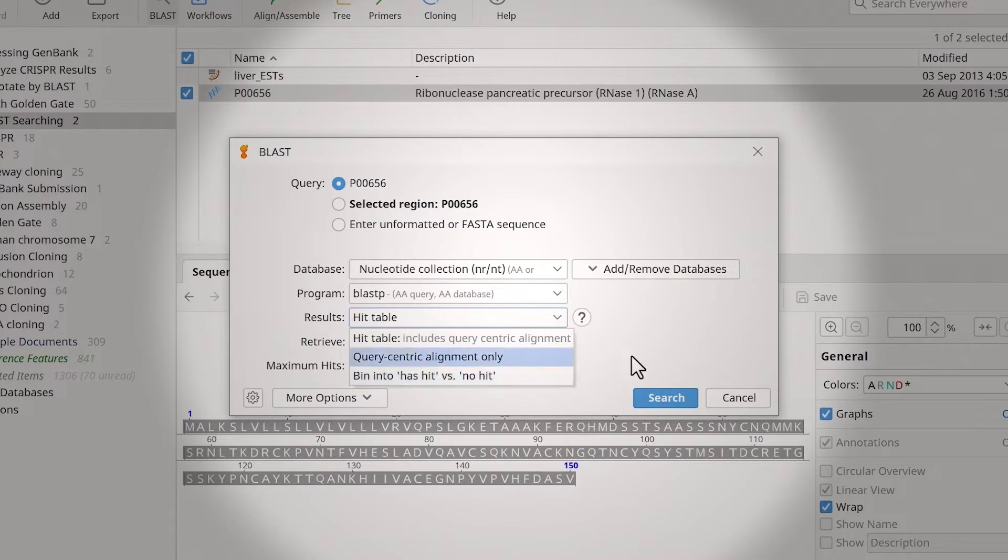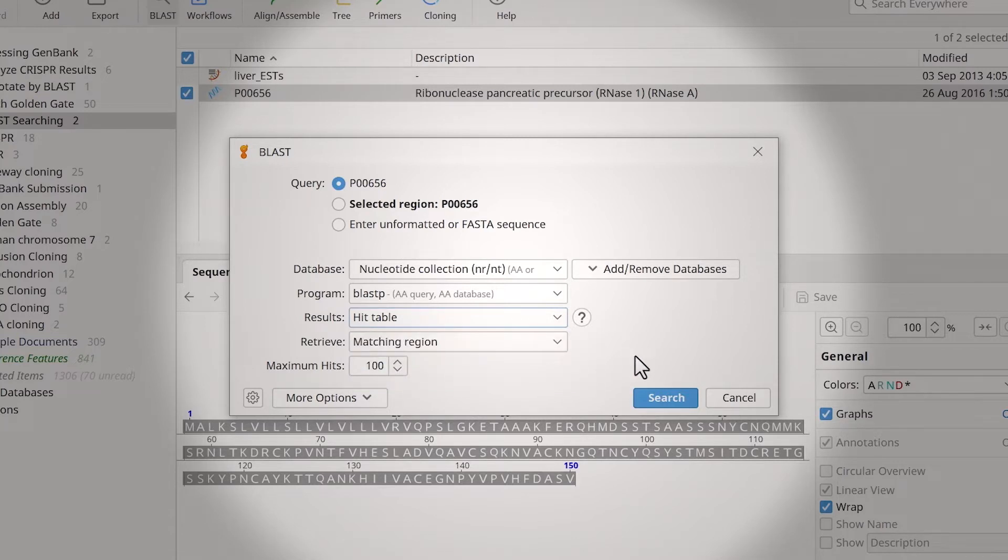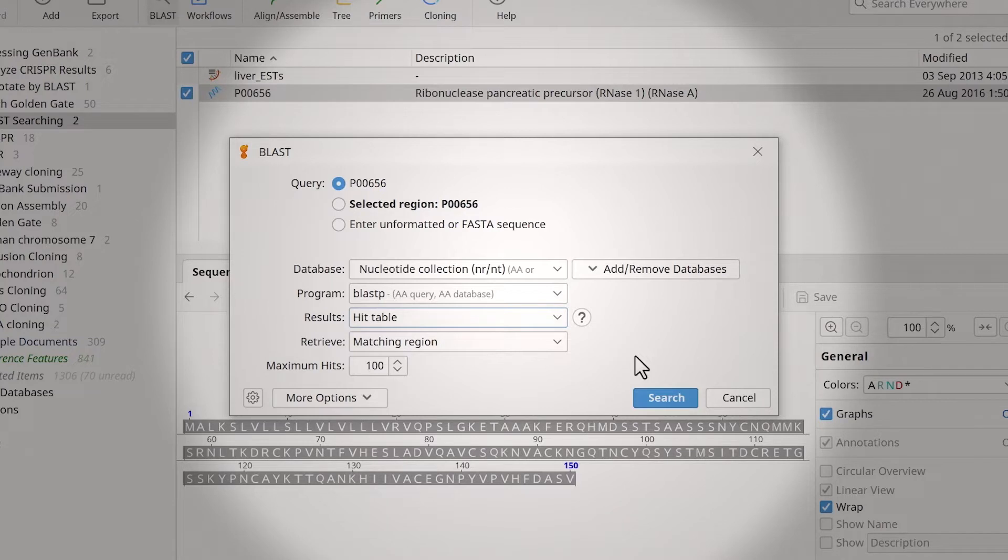You can specify how much of each matching sequence to retrieve using the Retrieve option, but note that retrieving larger sequences will slow down the BLAST process. Lastly, you can enter the maximum number of hits to return.